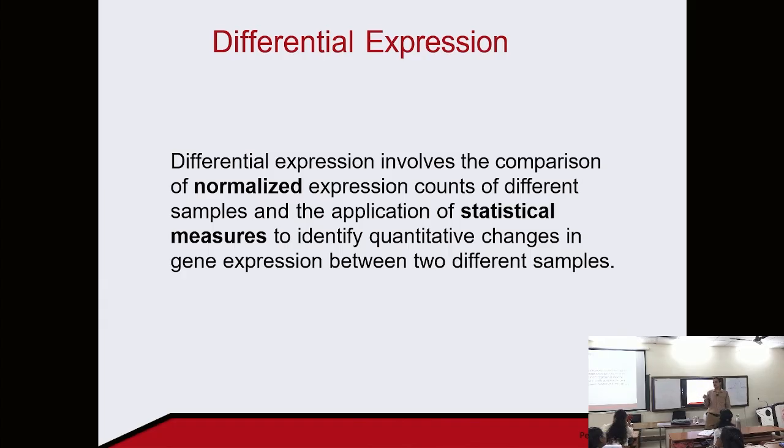The distribution actually is the negative binomial distribution. It is not normal. The distribution for the logarithm of the fold change follows a negative binomial distribution. It has been established, and that is used for assessing the statistical significance of a log fold change value. Clear? This is how it is estimated.